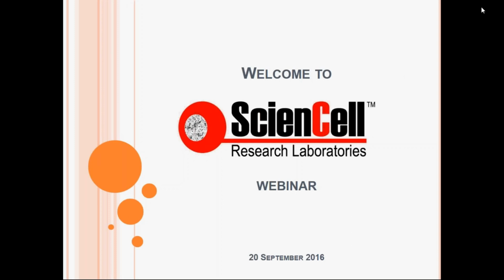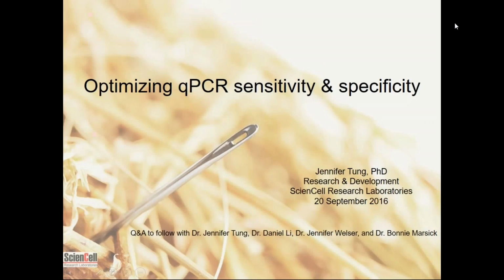I'm Sciencell R&D scientist Jennifer Tung, and I'll be your guide today as we delineate how one achieves optimal sensitivity and specificity in qPCR experiments. We'll first go over the benefits of qPCR for those who aren't particularly familiar with this method, followed by an introduction to common problems faced by qPCR users. The crux of our presentation will then focus on how to prevent, detect, and address those problems.